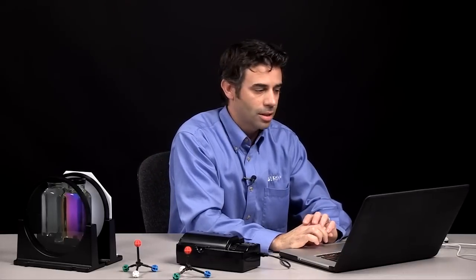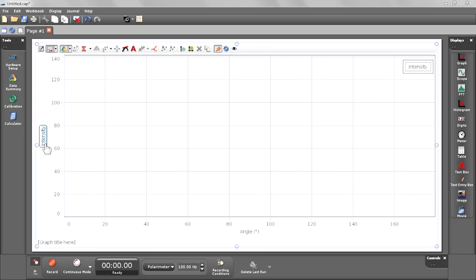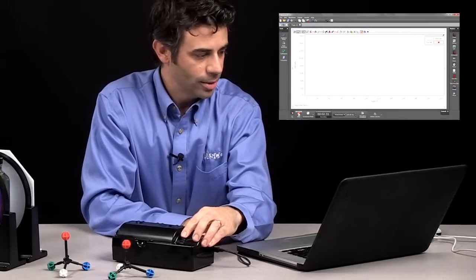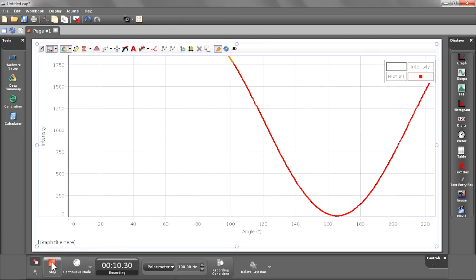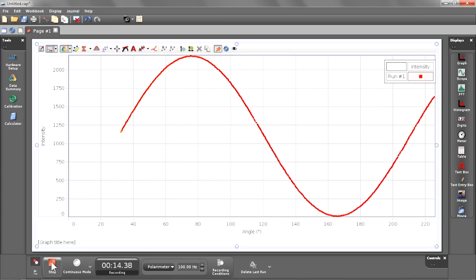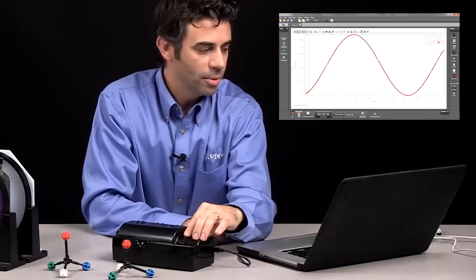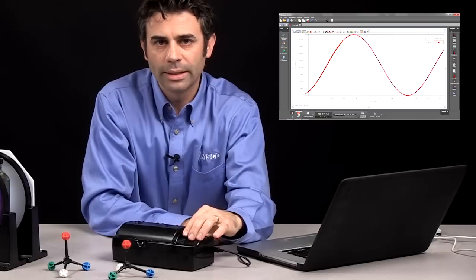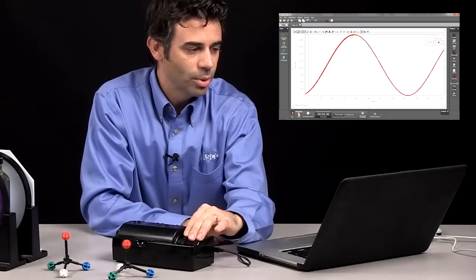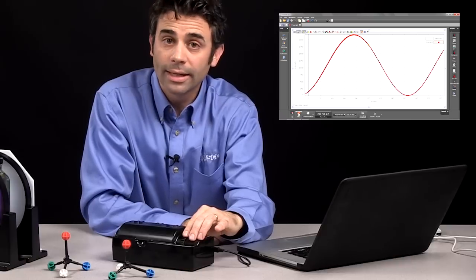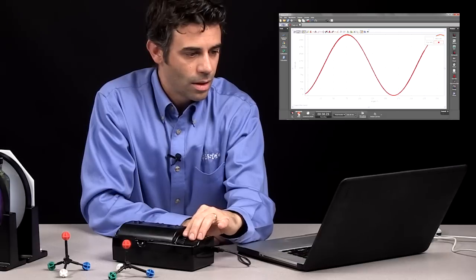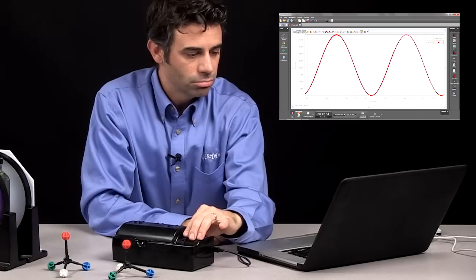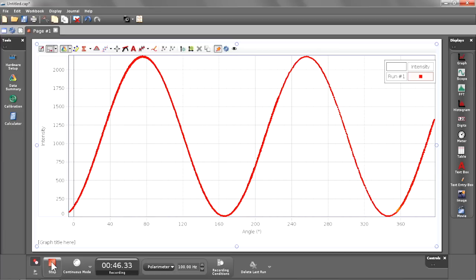Over here I have my polarimeter attached to the software. I have a graph of light intensity versus angle, so I'll be able to measure the angle of rotation. I'll hit record and start spinning the wheel. There's my plot of intensity versus angle of rotation — a nice plot. I'm going to go from 0 to 360 degrees a couple of times, just rotating around, to make sure I have lots of good data to get a good fit and really pinpoint the exact highest intensity angle. Once I've done a couple of cycles through to 360, I'm going to hit stop.